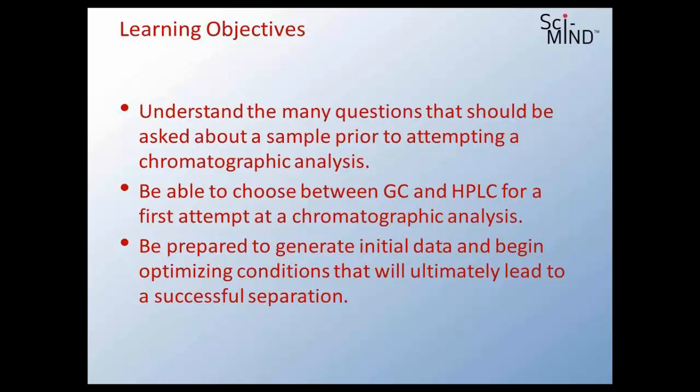I think that's one of our challenges, just asking enough and asking the right questions before we start injecting things on our instruments. One of the challenges that's always a fun argument, if you really want to get our subject matter experts going, ask them a question about a separation science problem you have and ask them whether they'd use GC or HPLC for that problem. I can promise you a spirited discussion if you have more than one of our subject matter experts in the room with you in Sci-Mind.